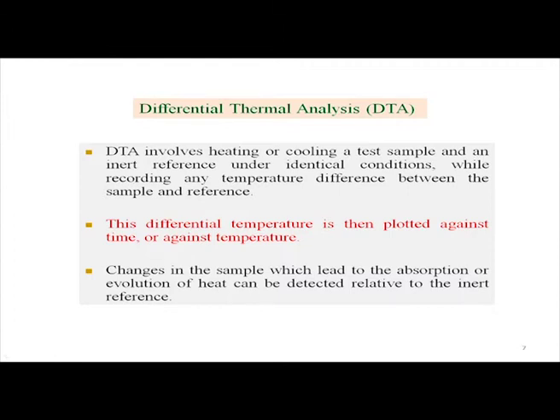The simple reference material can be like your crucible material, like alumina, it can be your alpha alumina also, and that alumina is also heated. So, how the temperature rise takes place for the alumina sample as well as your sample under test.